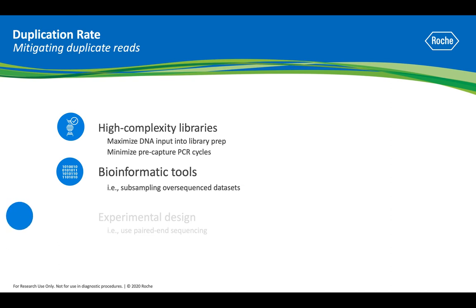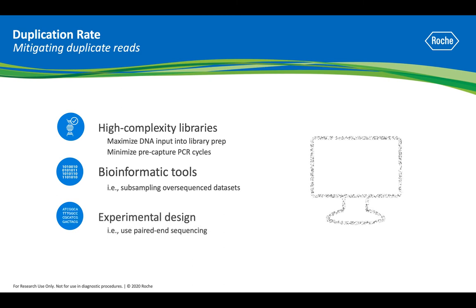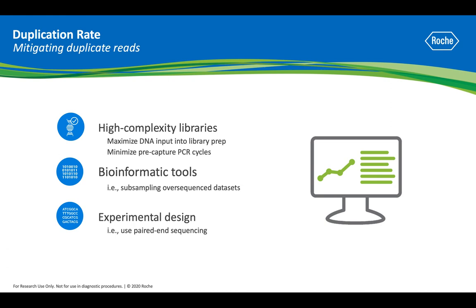Finally, adjust experimental design to help ensure low duplication rates. For example, when applicable, use paired-end sequencing to avoid increased duplicate read numbers due to analysis of single-end sequencing methods.